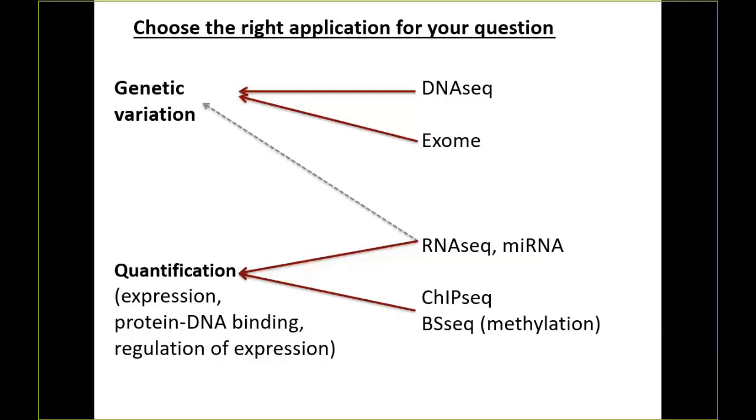There are occasionally attempts being made to get a little extra out of a sequencing method. For example, when I was a Collaboratory fellow, there were frequently requests made to take somebody's RNA-seq, most frequently done with cancers. Frequently it was somebody getting RNA-seq from a tumor and asking if I can take the RNA-seq from the tumor and do a variant discovery on this.